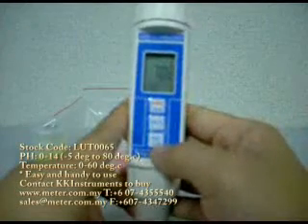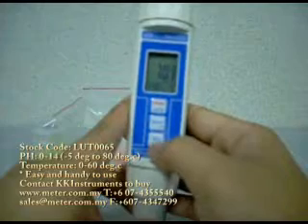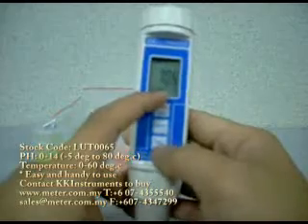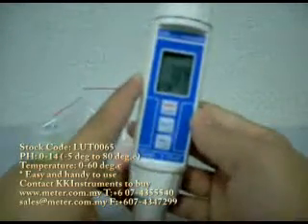If you hold this button for 3 seconds, the unit of temperature will be changed from degrees Celsius to Fahrenheit. If you want to change it back, you just keep holding it again, and it has gone back to degrees Celsius.